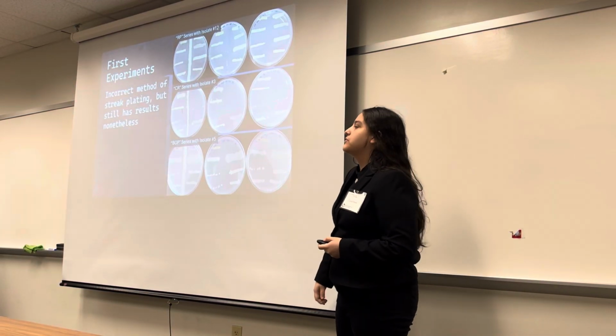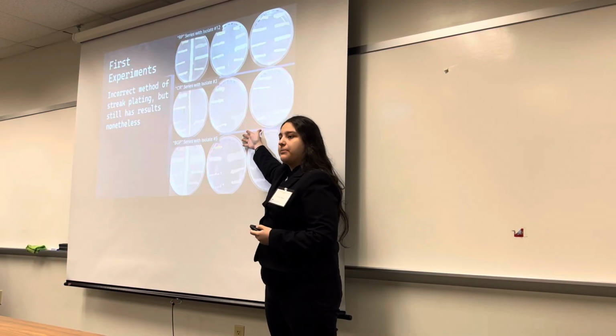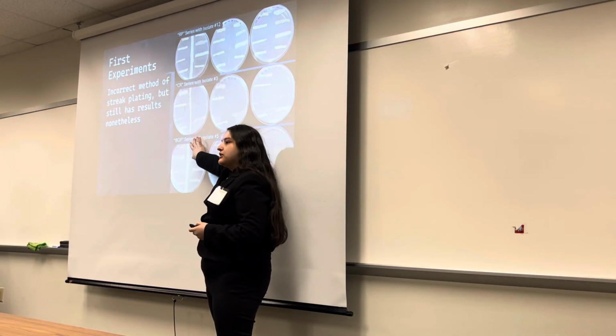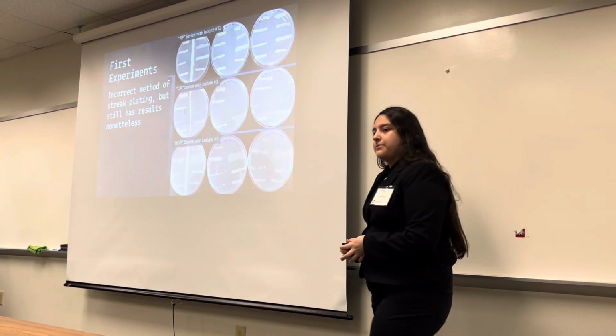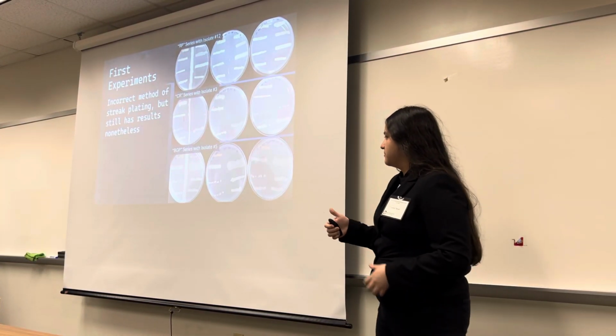Now for my negative control, it was these three different isolates, the positive being with L. antibioticus, a known antibiotic-producing bacteria. And then we have my experimental control group, which had the antibiotics from the very same soil sample as my non-producing bacterial colonies.